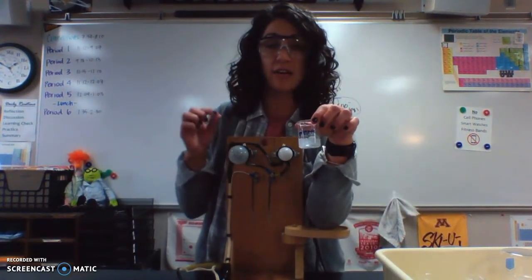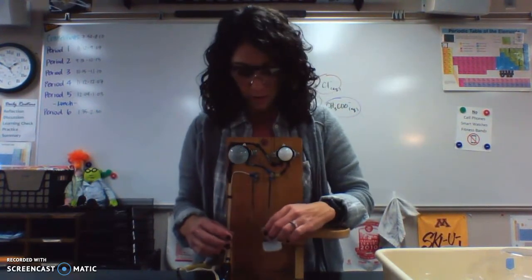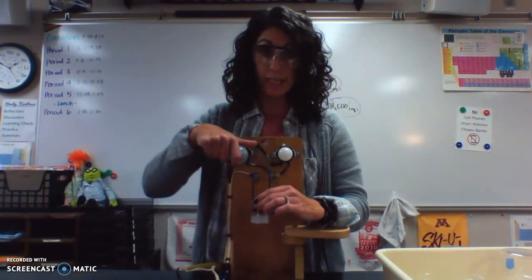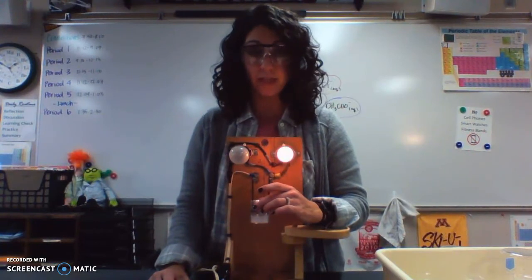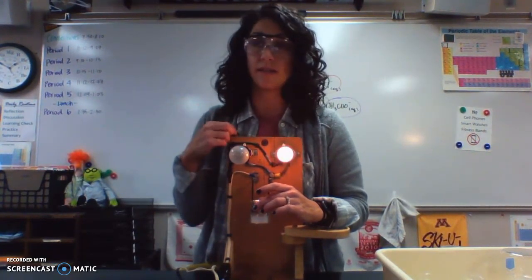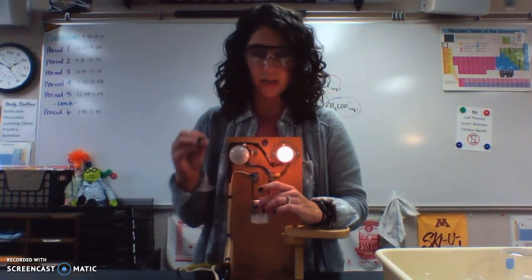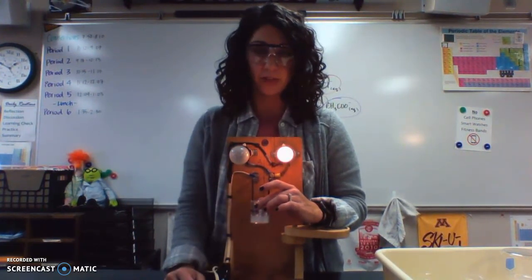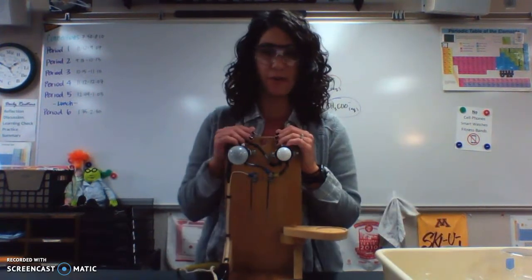So let's see, does Gatorade actually have electrolytes? Think about it. Are they telling us the truth? Oh boy, here we go. It's not strong, but it is weak. So Gatorade does have electrolytes. If you look at the bottle, it's going to have things like citric acid, sodium citrate. I can't remember all the names that are in there. But any of those ionic compounds are going to be electrolytes. So there you go. That is your data for your electrolyte lab.